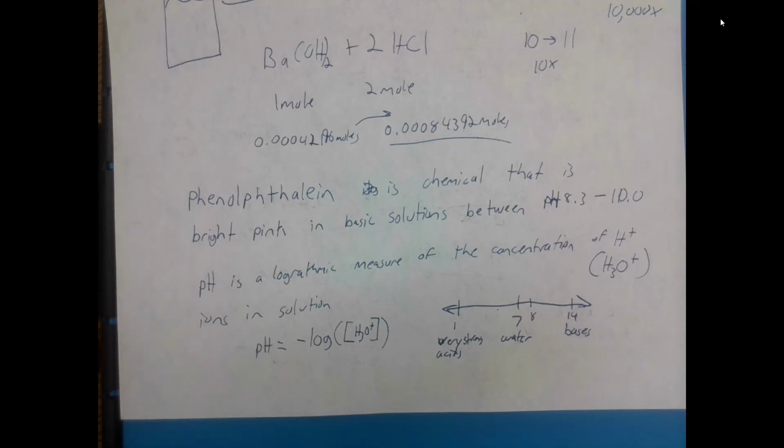Then you put the tiniest drop into it, you screw it up, and it just immediately clears. And you've added way too much. At that point, you don't know how much you exactly added, so you need to restart. Throw your solution away and try again.